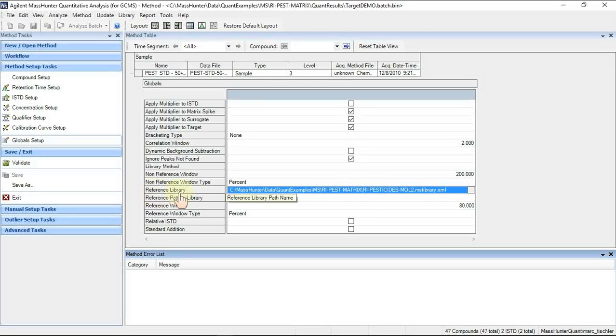That works, and that's been shipping for quite a while. That's the base case of quantitation using spectral referencing as a confidence sureness measure. So the reference library workflow is supported, and you can probably stop there if that's all you're doing.